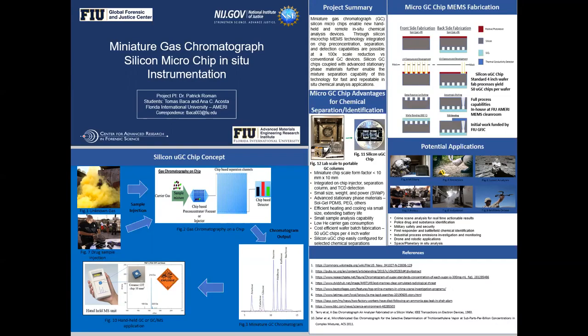So you may end up with chips that are designed to detect different classes of chemicals. Yes, and since it's replaceable, the software itself won't be affected by that at all. The chip could literally just be replaced when you're analyzing a different type of chemical or a different subset of chemicals, or a group that you are interested in at the moment. So the housing itself would not be at all affected. We could even have different ramping programs for the chemicals you're analyzing. At the end of the day, we just haven't decided what those ramping programs will be like, because we haven't figured that out quite yet. Sure, I can see the development of different chips for different chemicals based on final delivery or user need as well. If you have industrial manufacturing that needs a certain narrow window of detection, that would be useful.